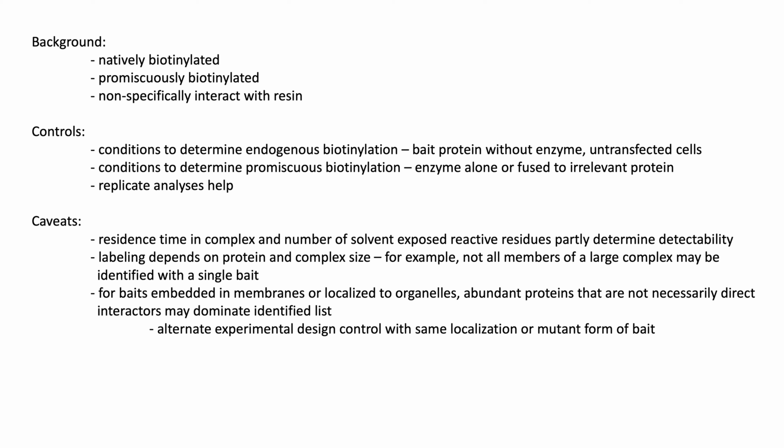There are also some caveats to these experiments that are important to keep in mind. The residence time of proteins in the complex and the number of solvent-exposed reactive residues will somewhat determine how detectable proteins can be. Labeling also depends on the protein and complex size. So for example, if you have a very large complex, not all members will be labeled by a single bait, and so multiple different baits may be required.